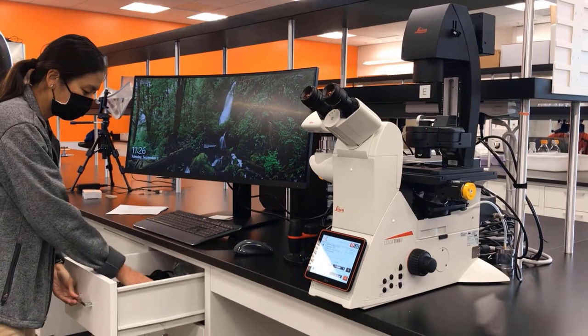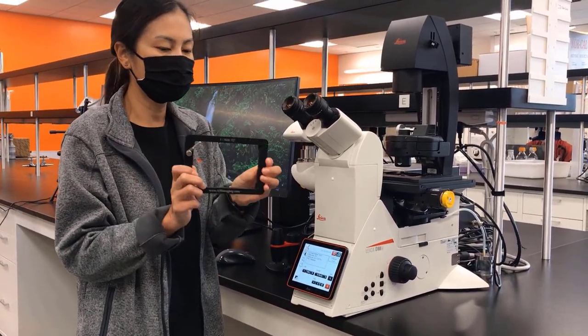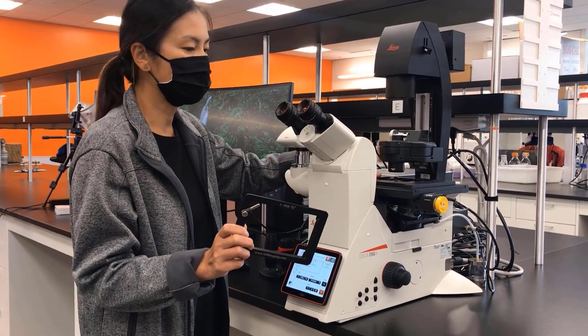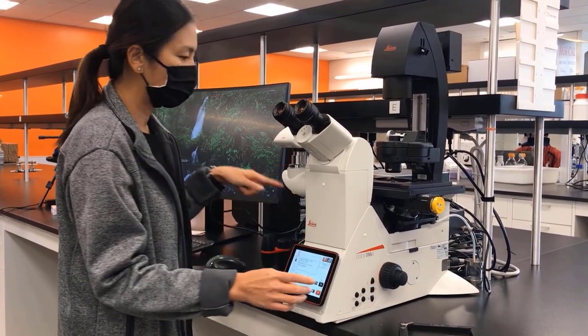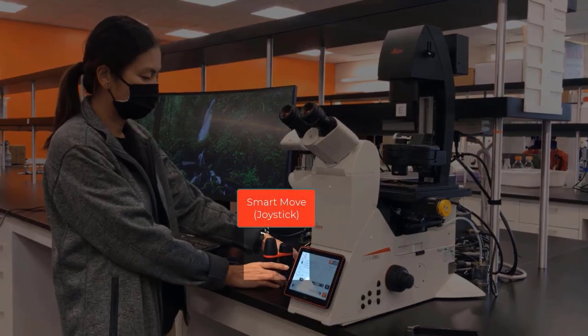This microscope comes with two stage inserts. One is a 96-well or well plate holder, and the other is for slides and small petri dishes. The next part of your microscope is the motorized stage, which is controlled by the smart move or joystick.